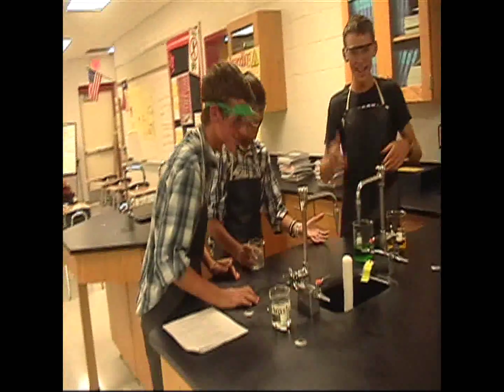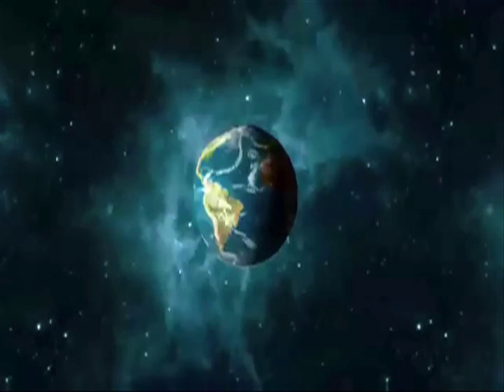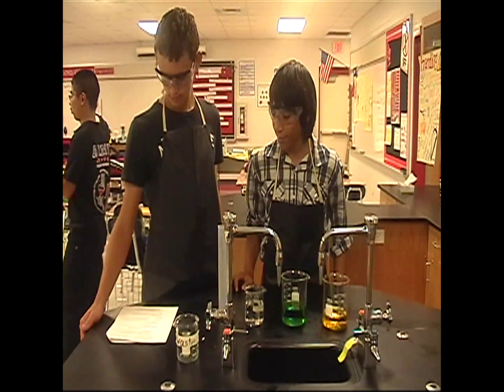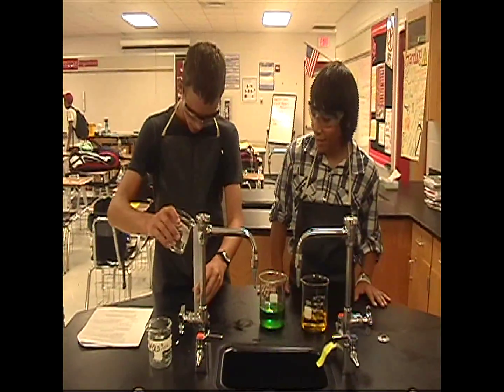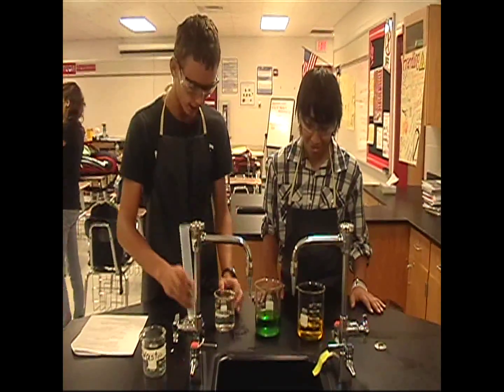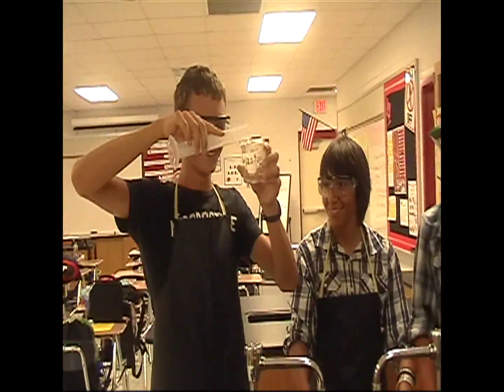Someone exclaims 'Oh my gosh — what sorcery is this?!' and calls for the fire extinguisher. Later, a correction is given: 'Now we're going to put 30 milliliters of the acetone into the yellow substance.' When a character takes too much and considers putting it back, they're stopped: 'No — whenever you take too much of a chemical, you can never put it back where you got it from. Otherwise you can contaminate the original solution. You have to put it in the waste container.' The character complies: 'Okie dokie.'